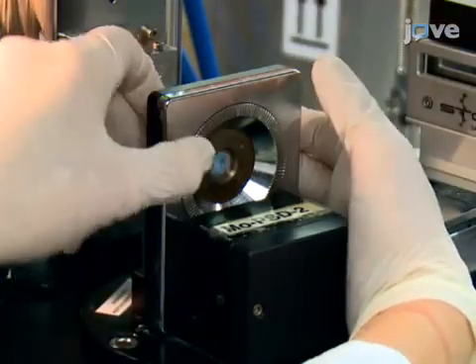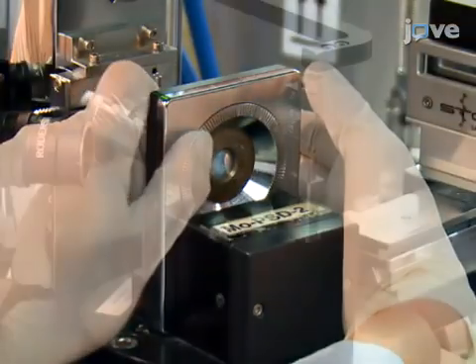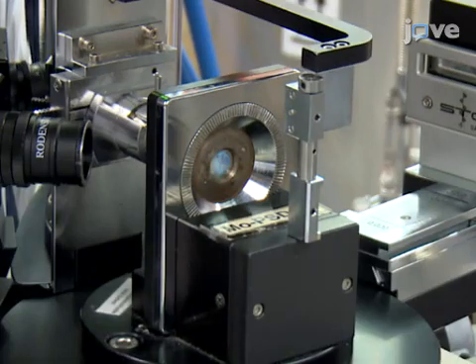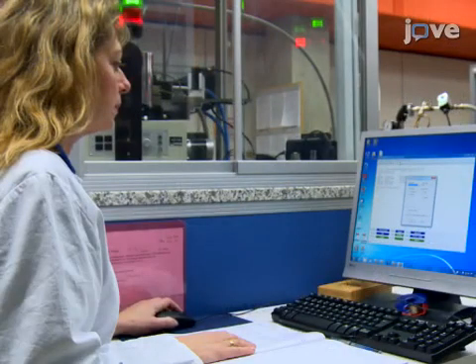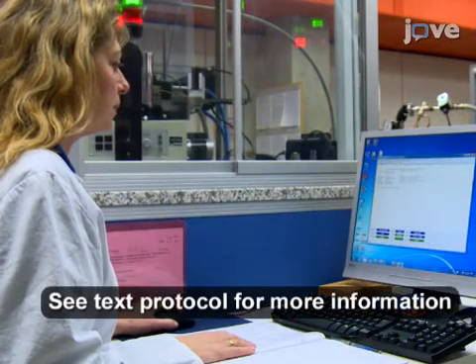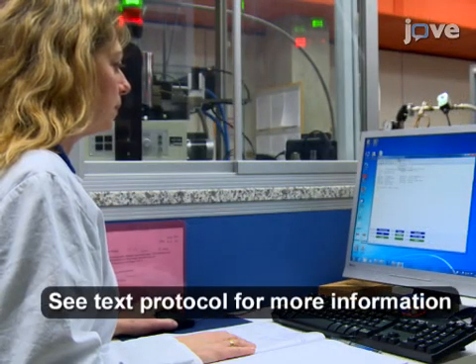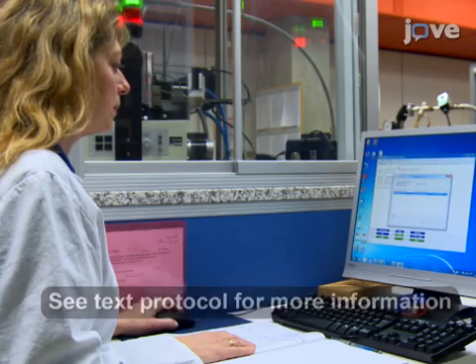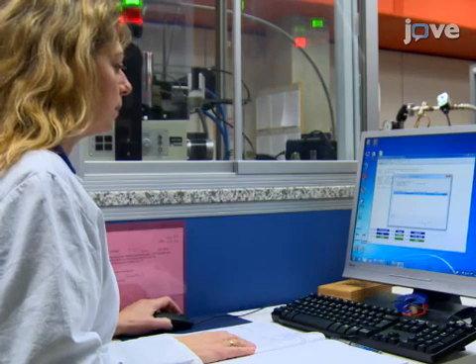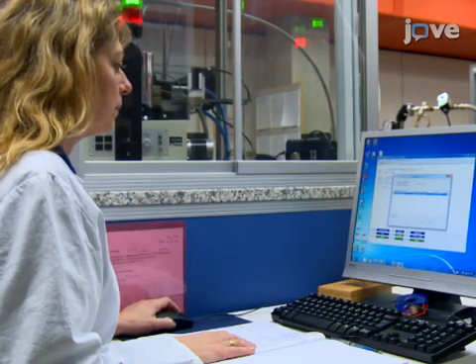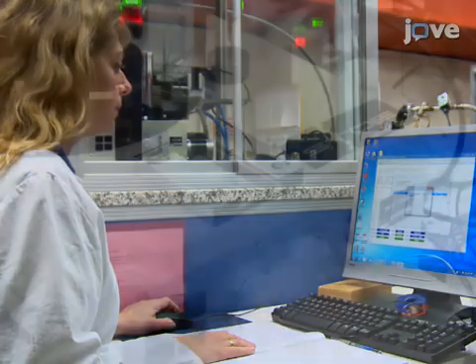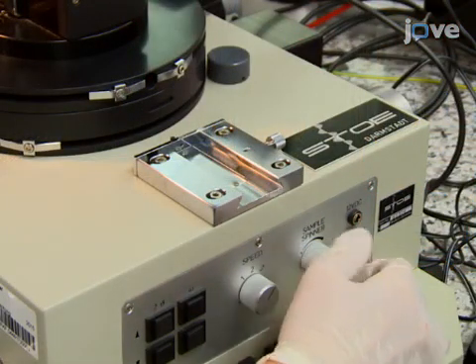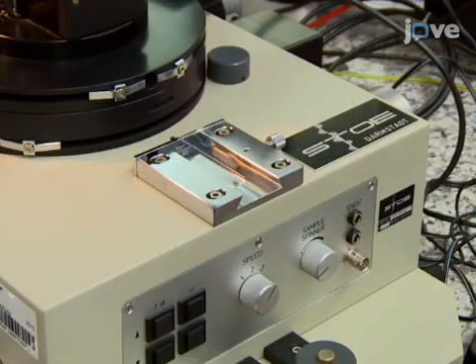Fix the transmission sample holder on the theta circle of a diffractometer. Measure the sample for 20 hours from 5 to 85 degrees 2-theta with a step width of 0.015 degrees 2-theta in transmission mode. Turn rotation on in order to achieve better particle statistics.